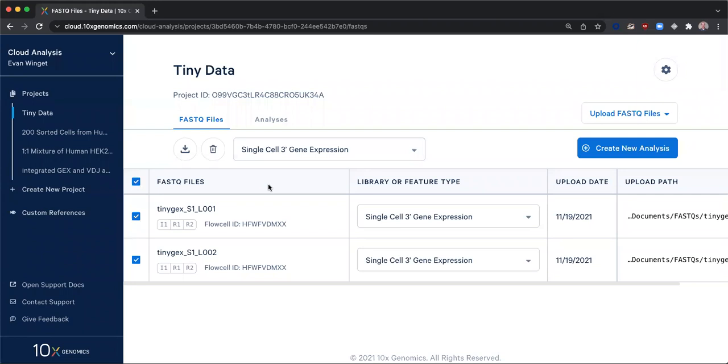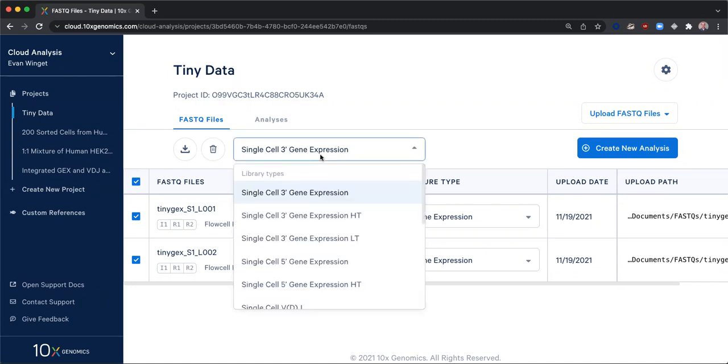I selected both of the FASTQ sets in the table and then used the library or feature type selector above the table in order to assign a library type to my files.